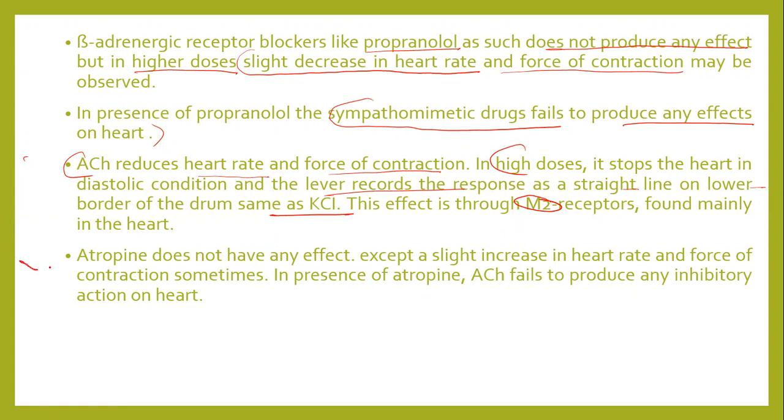The atropine does not have any effect except a slight increase in the heart rate and force of contraction sometimes. In the presence of atropine, the ACh fails to produce any inhibitory action on the heart.